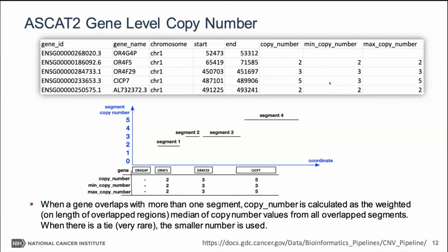If you are really interested in a more detailed analysis, you probably want to look at the segments themselves and see how they affect the gene. Sometimes maybe just a non-transcribed region or the 5' end is modified instead of the main gene body. That's something you probably want to pay attention to.